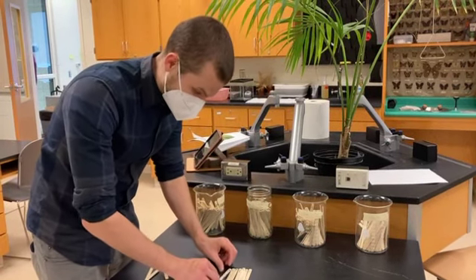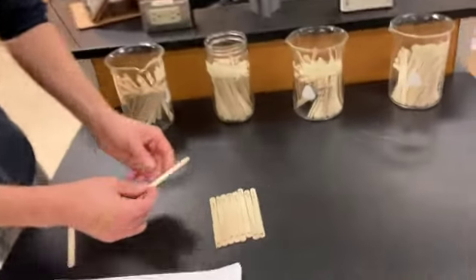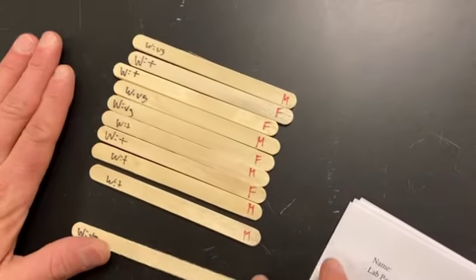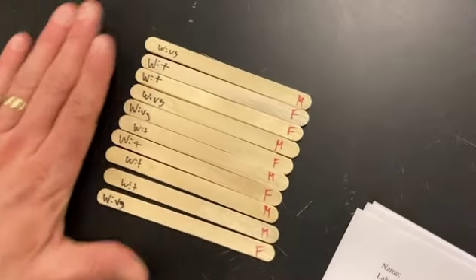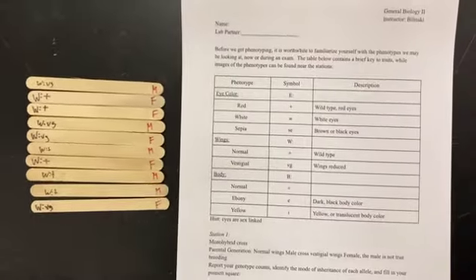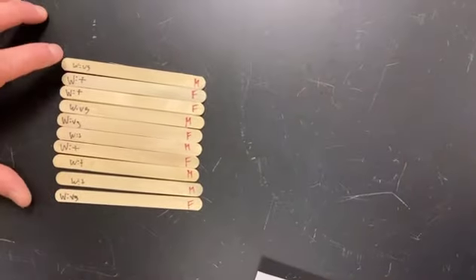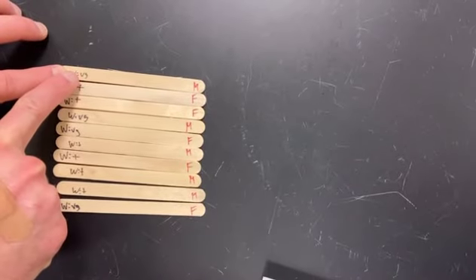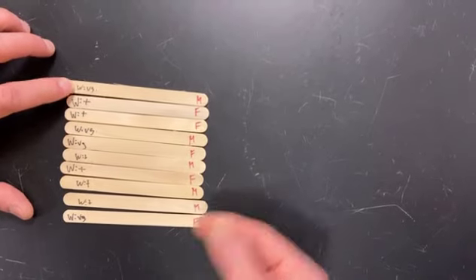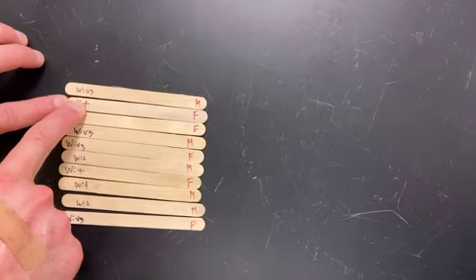Because with each of these popsicle sticks, you can see what the fruit fly looks like, but you cannot tell what its genetics are. So looking at this sample from station 1, and again, this is in combination with the table from the lab. You can see the table itself gives you a little bit of a key. We can see that our fruit fly had wings that were VG or vestigial, and it was a male. You can see the gender on the right written in red, and what the fruit fly looks like on the left. A plus indicates wild type.